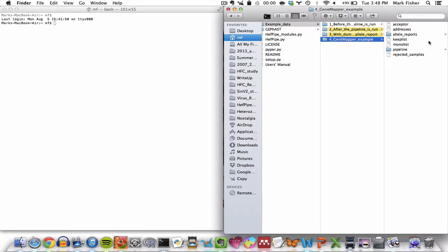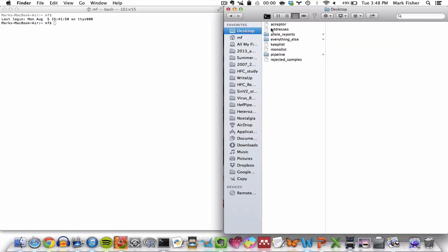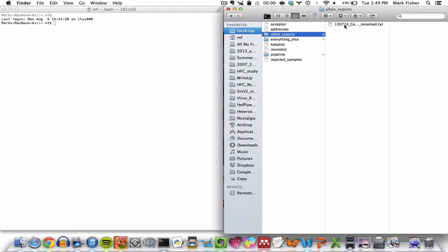So what I did is I just copied all the contents of that directory into my desktop. So before I run the pipeline on this example data set, let's have a look at the GeneMapper formatted file, which you can find in the allele reports directory.